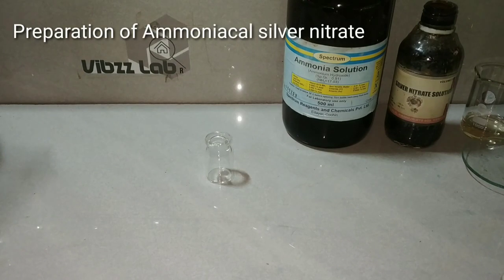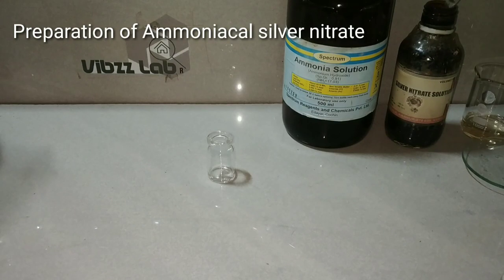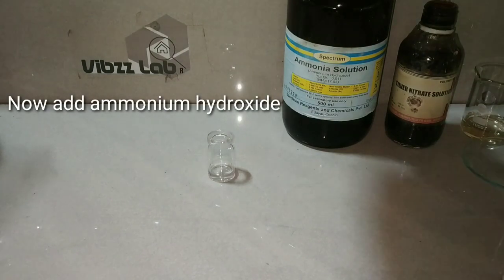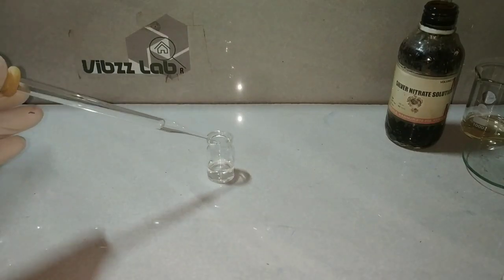Before reacting the Tollens reagent with resorcinol, we are preparing the Tollens reagent. First of all, we have taken silver nitrate in that small glassware, and then I added excess of ammonium hydroxide into it.